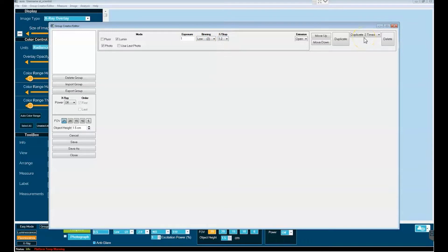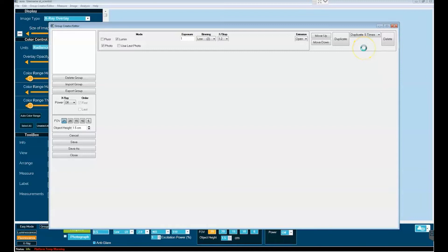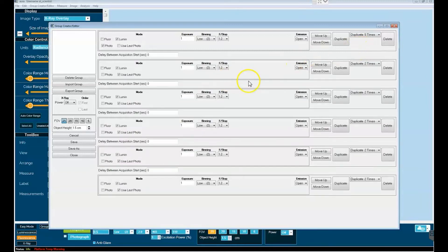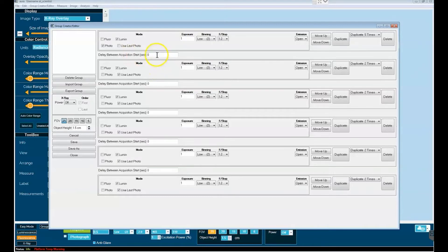Now, here's the neat feature of Group Acquire. You can set up multiple acquisitions. We'll go ahead and let's say duplicate this five times and now what we have is a set of a total of six acquisitions and you'll note that between each acquisition you have the option to delay the acquisition of the following image by x number of seconds.